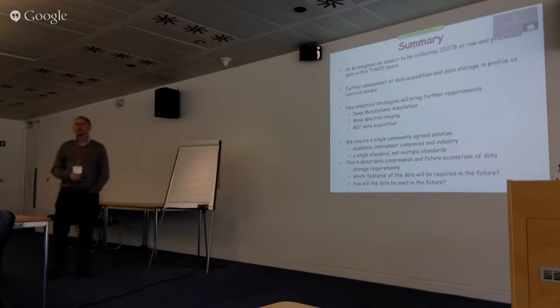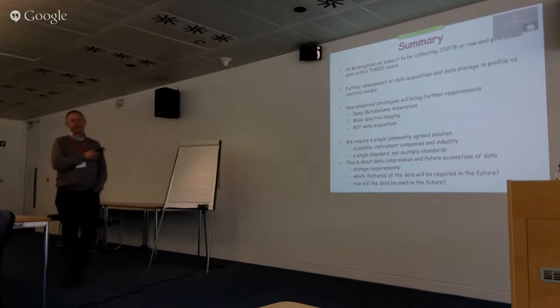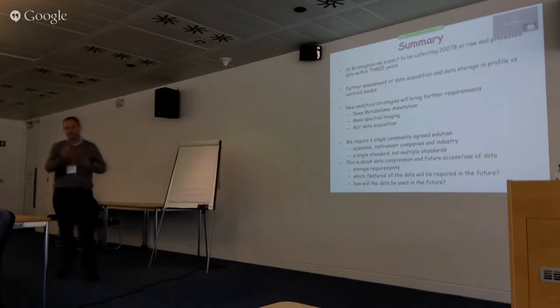It seems that all the mass spectra are from the same vendor. Is that your case as well? The Phenome Centre Birmingham, there'll be instruments from Waters and from Thermo. It's basically a 50-50 split.